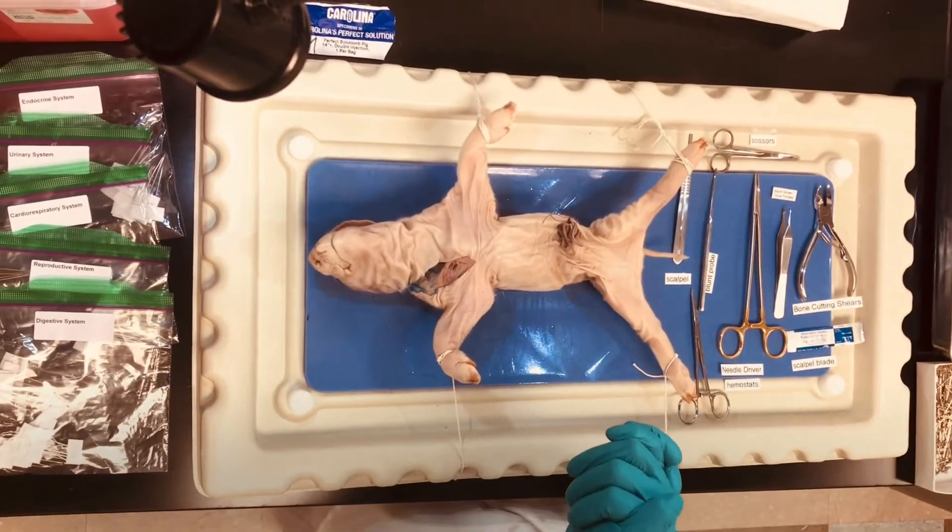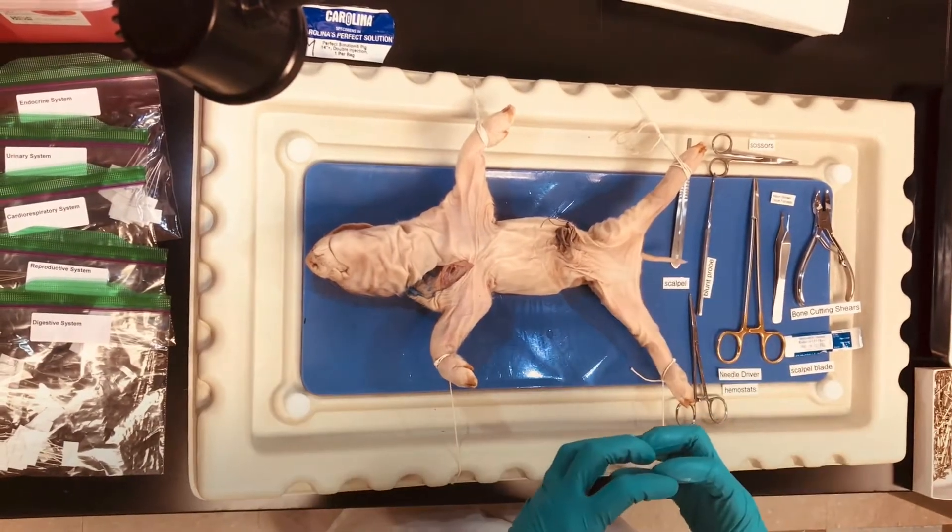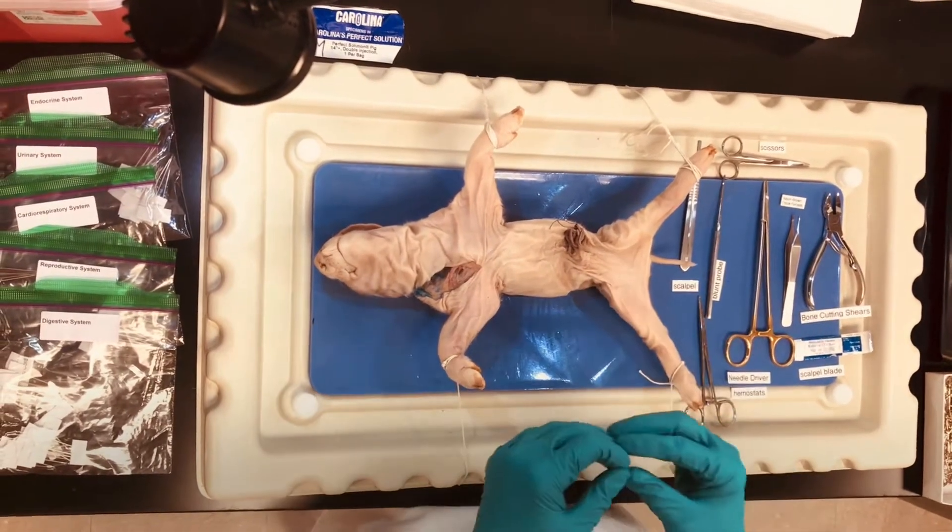All right, hello students. Today we are going to begin our pig dissection, and in our laboratory book you can find this in lab 13.